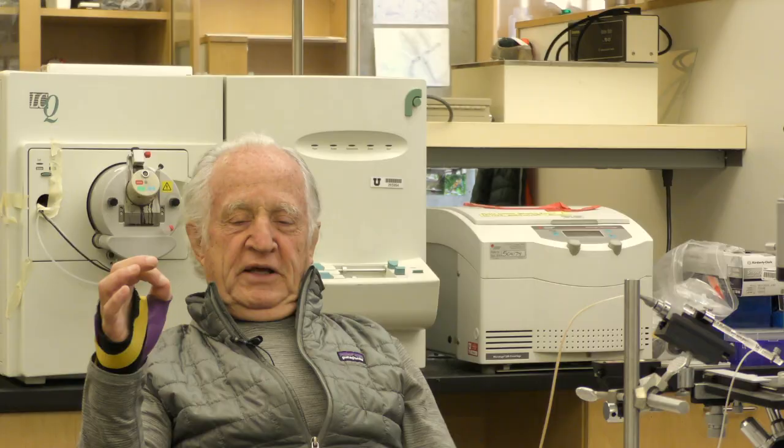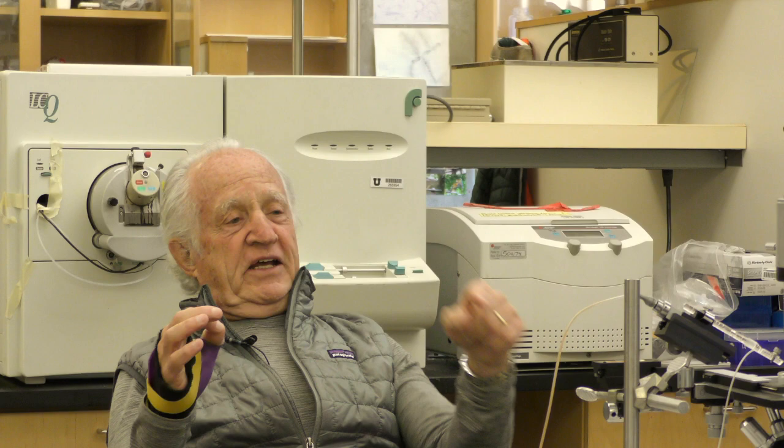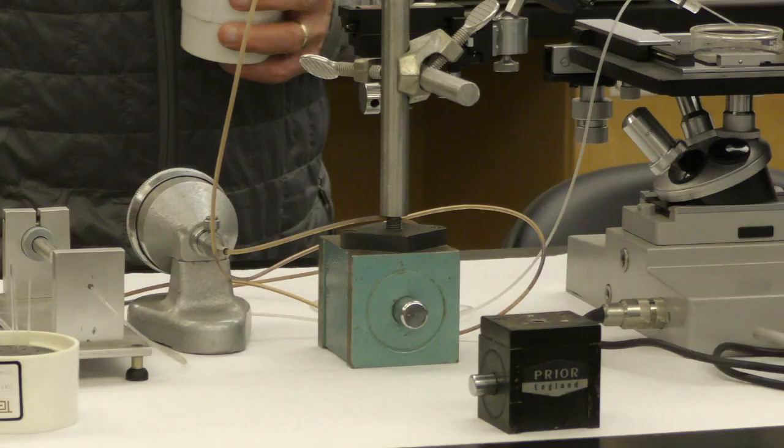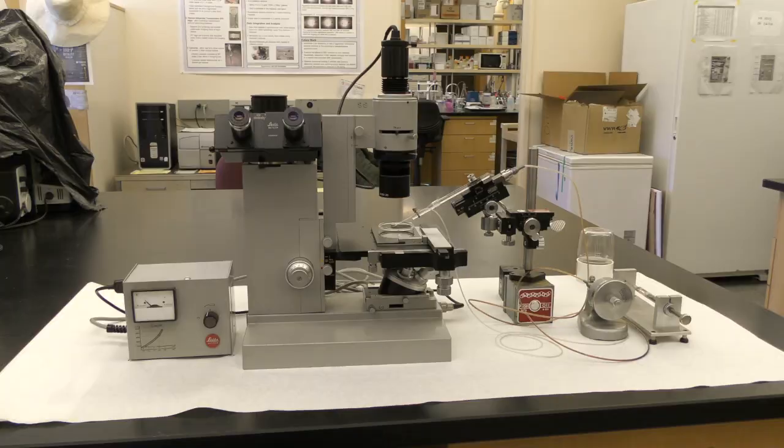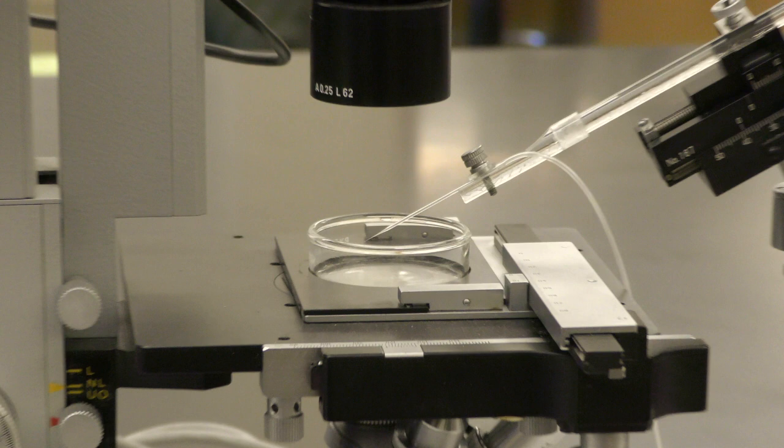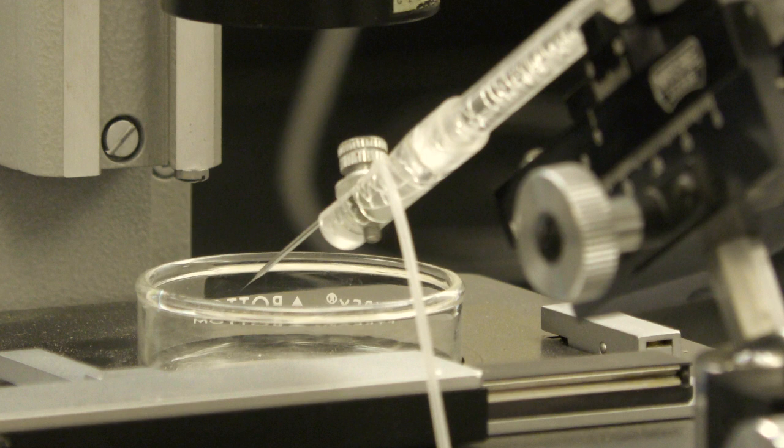The tip of the needle is so small that I can't see it under this microscope. The needle is about a hundredth as big as a hair, maybe 1/1000th, somewhere in that range. It's a very small needle and you have to be very careful with it because if you touch it on something it explodes. So you can't just zoom.